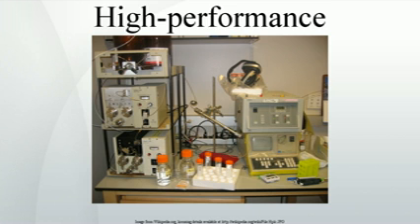The retention can be decreased by adding a less polar solvent, methanol or acetonitrile, into the mobile phase to reduce the surface tension of water. Gradient elution uses this effect by automatically reducing the polarity and the surface tension of the aqueous mobile phase during the course of the analysis.